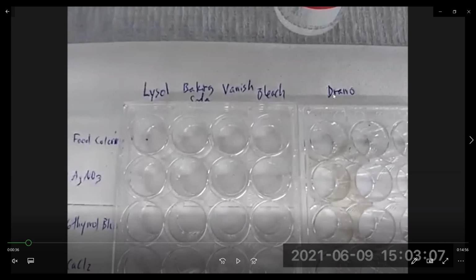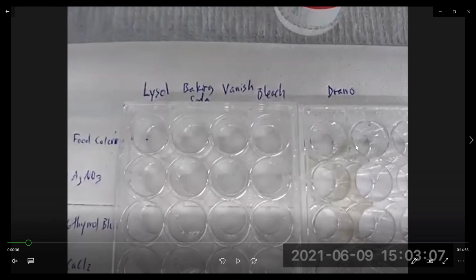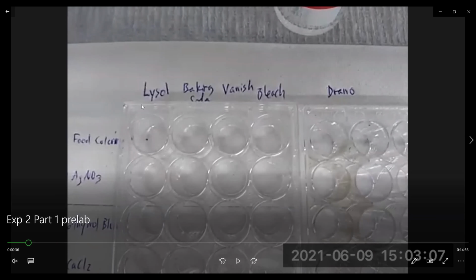One of the key ingredients in Drano is sodium hydroxide. It's a very caustic, very basic solution. So when we're doing our demonstrations, we're going to be using Drano, and I'll explain some of the results that we get from Drano to help you analyze the results you get from your household chemicals.